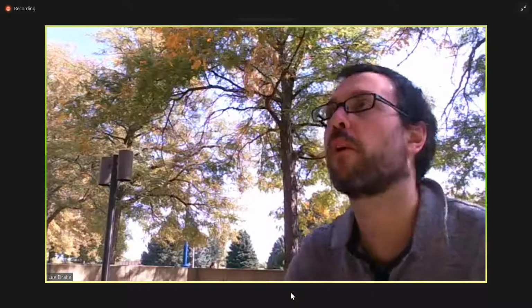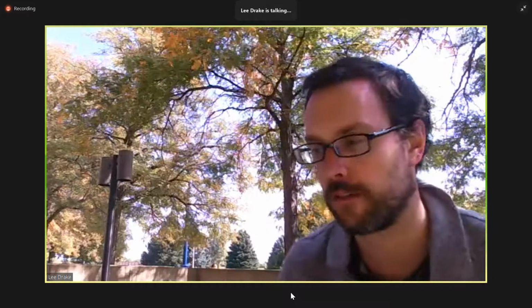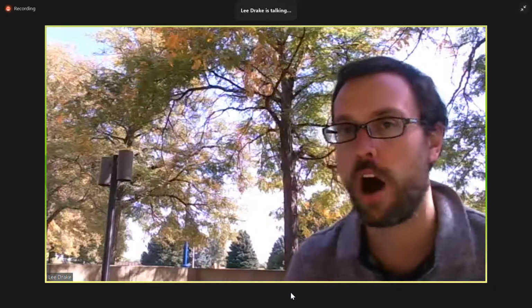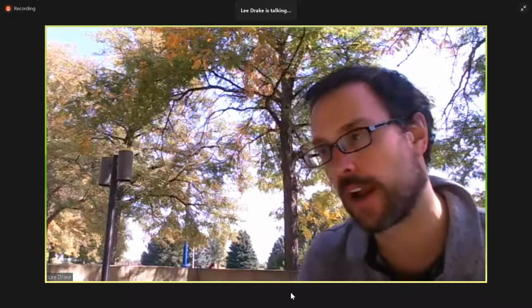So let's unmute. Historic lead bullets. I worked on a project similar to this with some folks at Grand Junction. I should probably put you guys in touch, actually. You guys have similar interests. For lead bullets, your big challenge is going to be lead. That's actually going to be a massive challenge because lead is one of the most dense metals available for XRF.